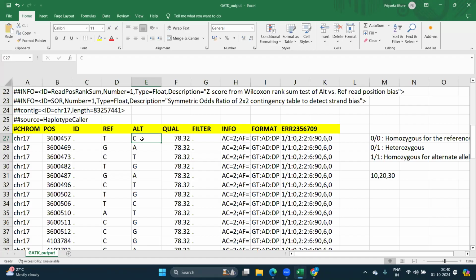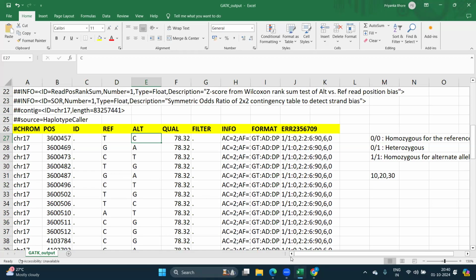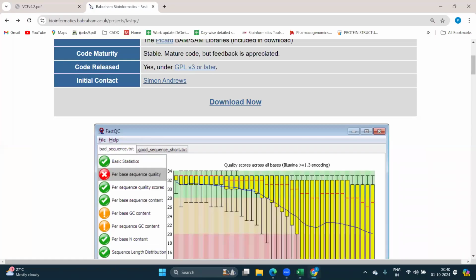But sometimes these variations are already present, or extra information for the variation is available in the databases, so that we can retrieve it, right? If you want to get the information about the variation, we have one tool, the Variant Effect Predictor, which is VEP, Ensembl VEP. So now for all these 55 variations, we are going to retrieve the extra information. So how can you retrieve it?